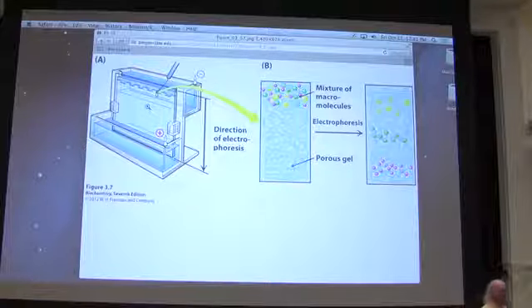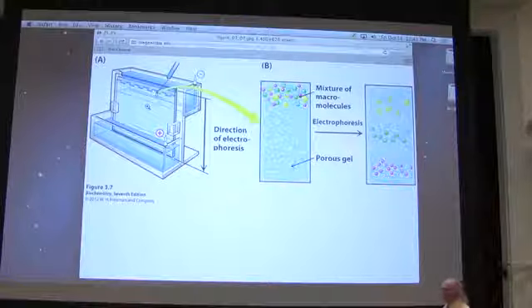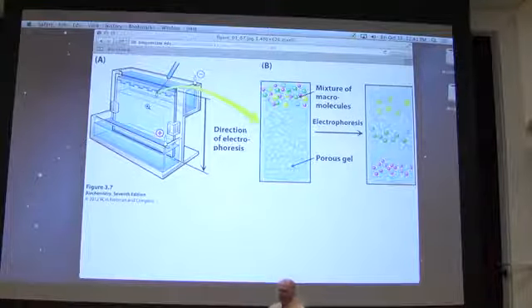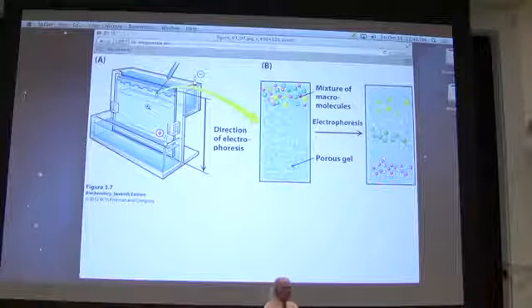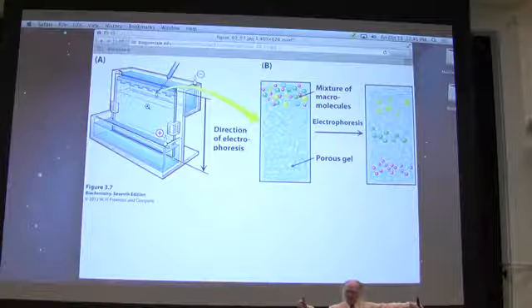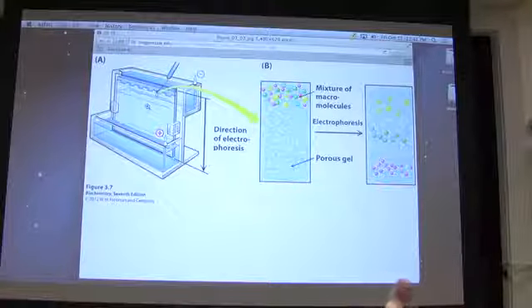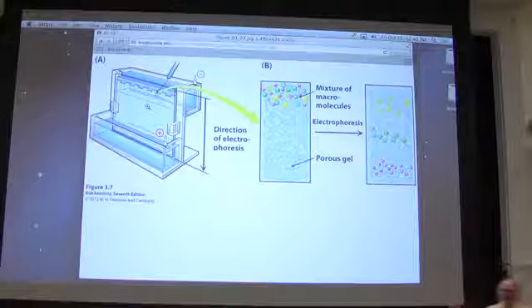If I want to separate proteins by polyacrylamide gel electrophoresis, I have to use a very cool trick. I'm going to describe that trick to you. I have to make the proteins have the same property as DNA had. DNA's property was the longer it was, the more negative charges it had. Remember, DNA is a rod. It's elongated. Most proteins, I said, are what form? Globular. They're not elongated, right?